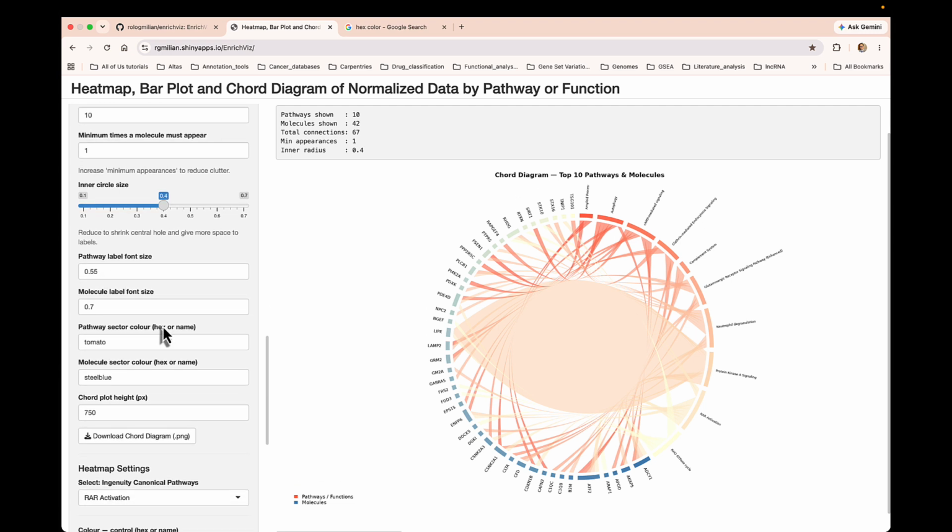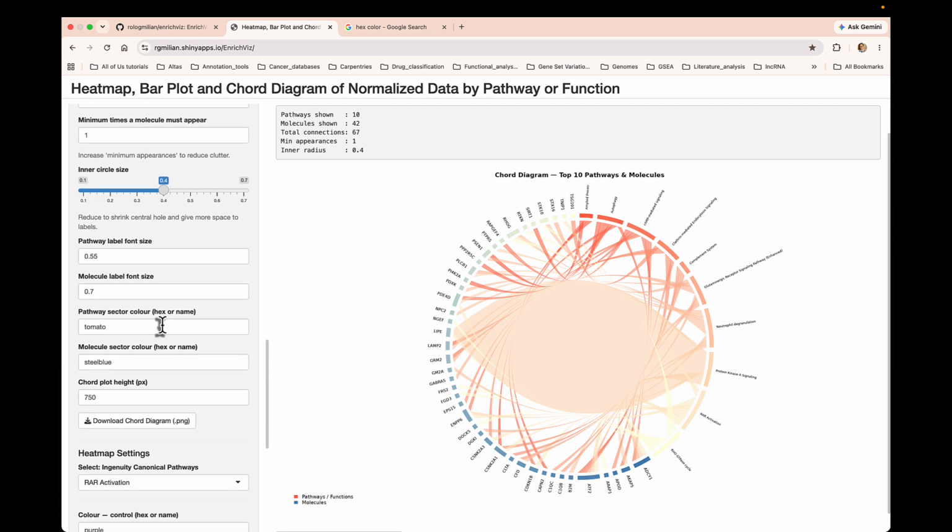I don't want to go over it, but see, it's data agnostic. You can put in transcriptomics, proteomics, and I'm totally sure you can put metabolomics. I haven't done the test, but you can do that test and let me know how it works.